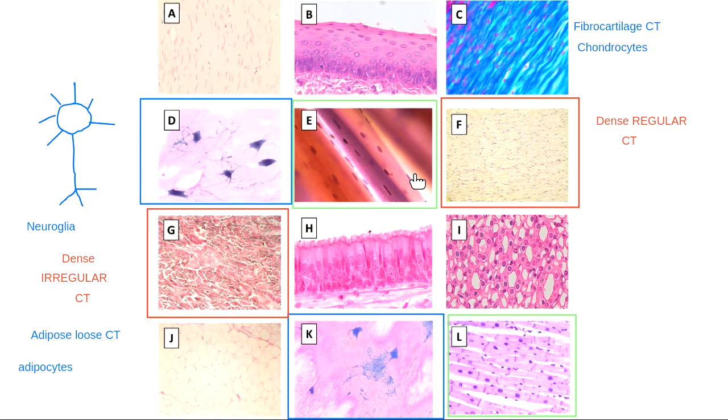Yeah, so this is muscle tissue. It is in particular that skeletal muscle tissue. I'll change to black to type its name. This is, let me type it, skeletal muscle tissue. This is the other way that skeletal muscle tissue can look. This is my more favorite way that skeletal muscle tissue looks.